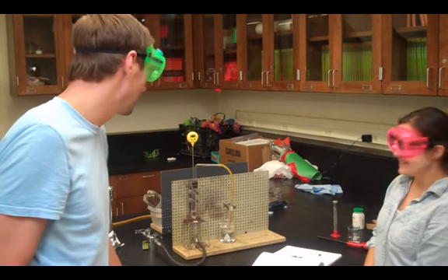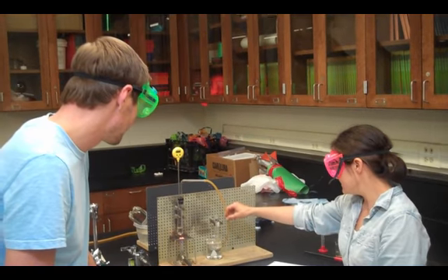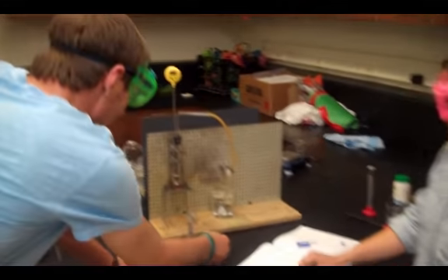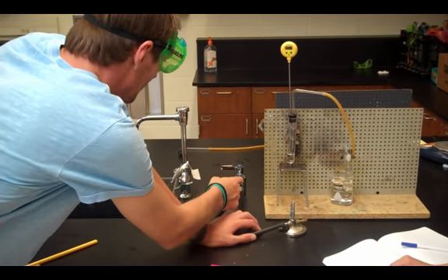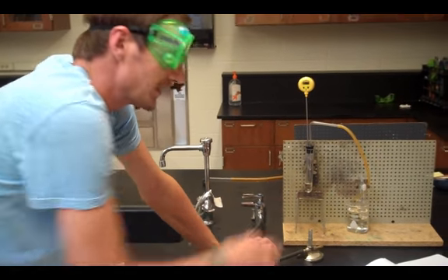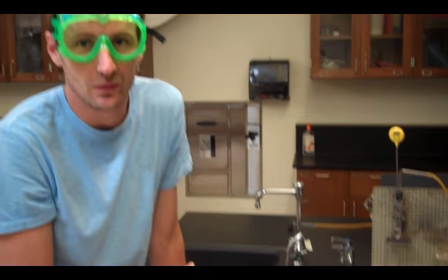So the first thing you're going to want to do is take your rubber tubing out of your test tube. Once you've done that, take your Bunsen burner and turn off the gold valve, and then make sure your gas valve is pointing towards the sink. You're going to let that sit because it's really hot. Let it sit for 5 to 10 minutes, and then make sure you clean up everything and put it back where it belongs.